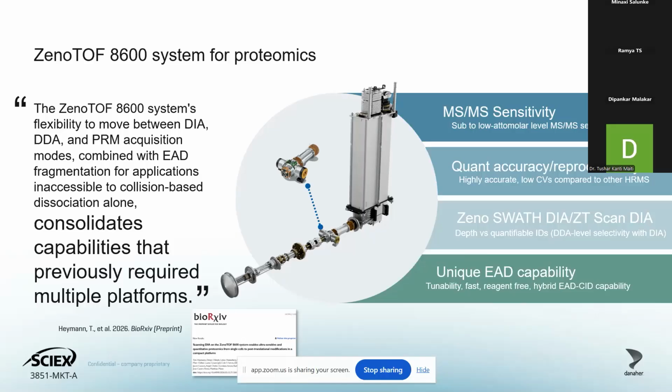If I compare it with the ETD technique, electron transfer dissociation, here you will get some additional advantages over ETD. One is the tunability, from smaller molecular weight compounds like metabolites and lipids, to glycopeptides, disulfide bonded peptides, or routine peptide analysis, the EAD electron kinetic energy.